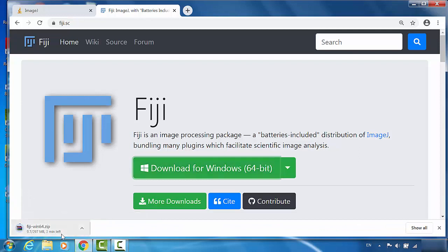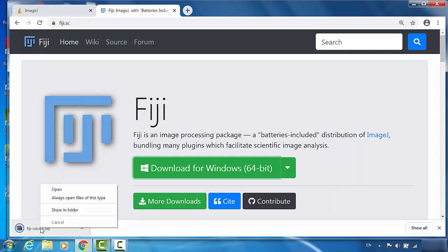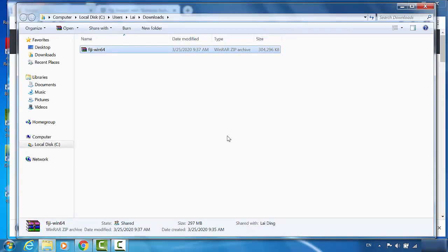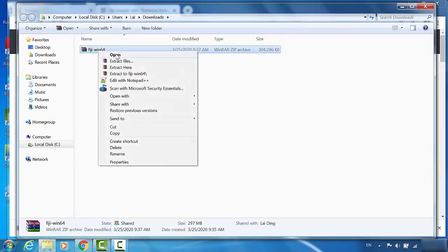The file size is about 300 megabytes. It takes some time to download. Now it's finished. We're just showing the folder. I'm going to extract it.